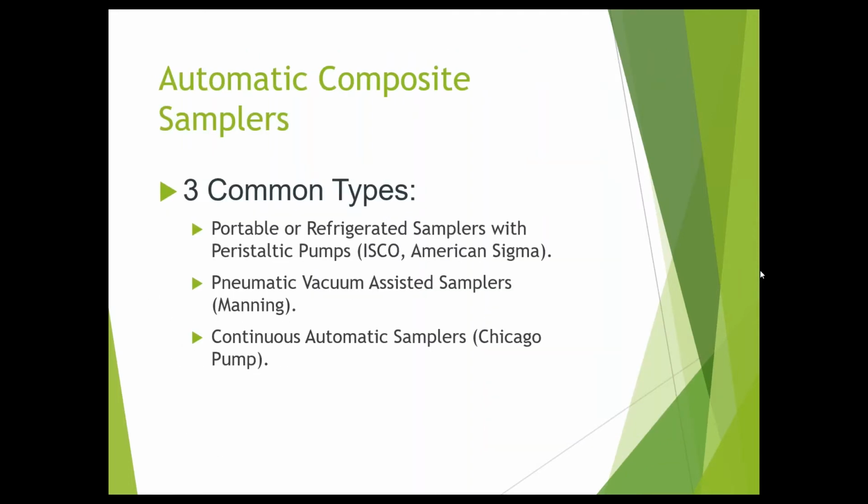Cornell, I have another question for you from the question box. Carrie Neal asks, if you're conducting a compliance sample of a permittee with flow proportional 24-hour composites, does EPA also do flow proportional, or do you do time due to sampler constraints? It depends on what we're going for in the permit. If, let's say, it's a batch reactor with irregular flows, then EPA really should be using flow proportional sampling. Again, the goal is to get a representative sample, and to get that representative sample and not sample dead space, it should be flow proportional sampling.